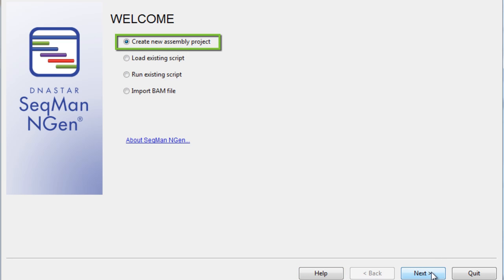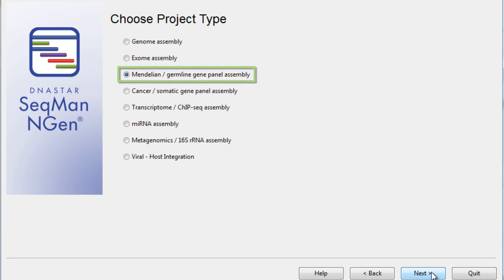But first, I'll select the Create New Assembly project, and then select the Mendelian Germline Gene Panel Assembly project in the Project Type screen.